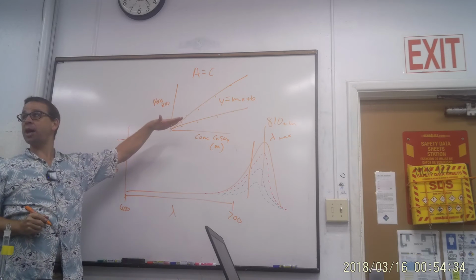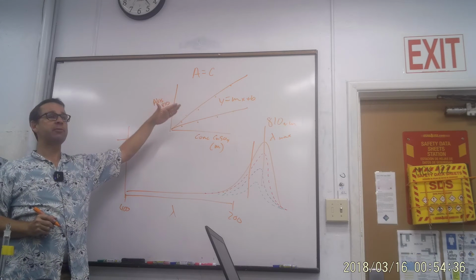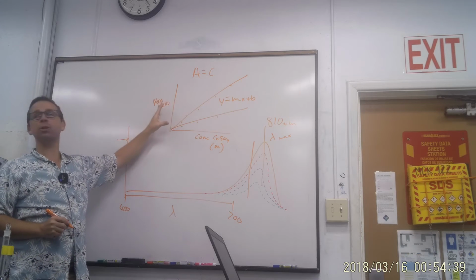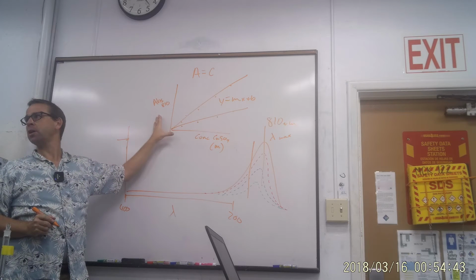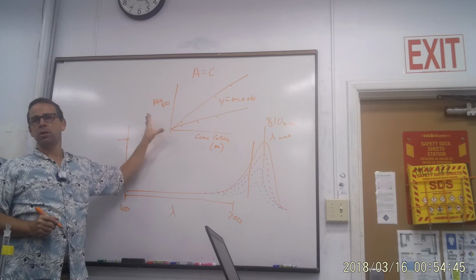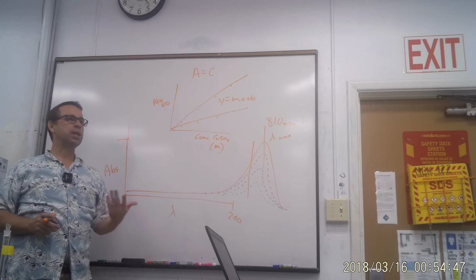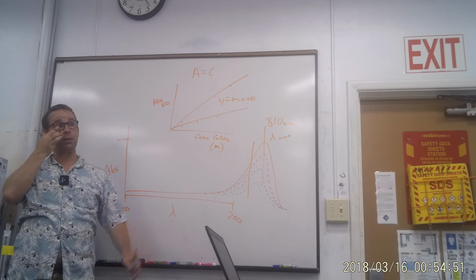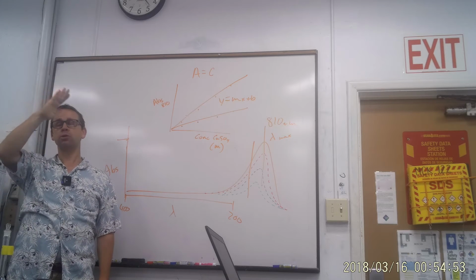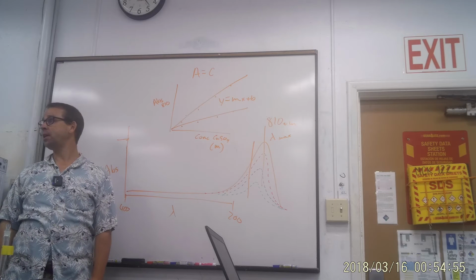The slope would be shallower. What's the ramification of using a shallower slope in a, what's this thing called? Standard curve. What's the relationship, or what's the ramification of using a shallower slope in a standard curve? Should I say it again, or do you got it?